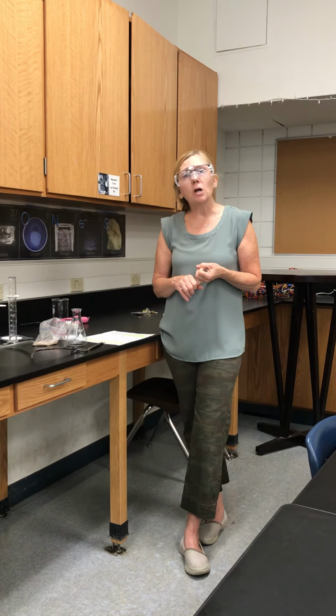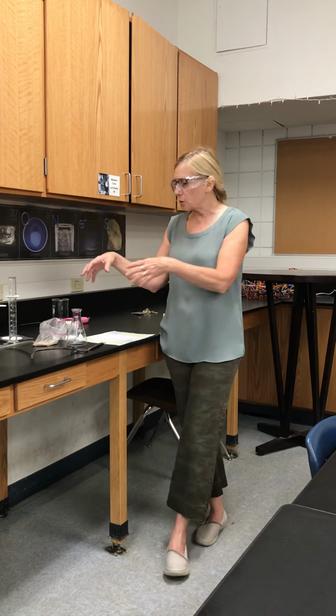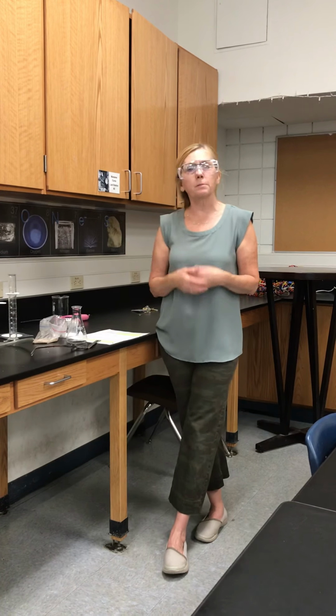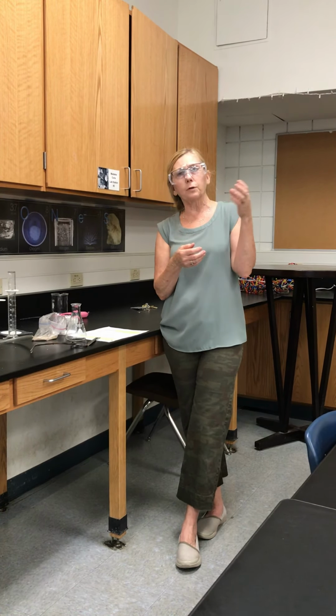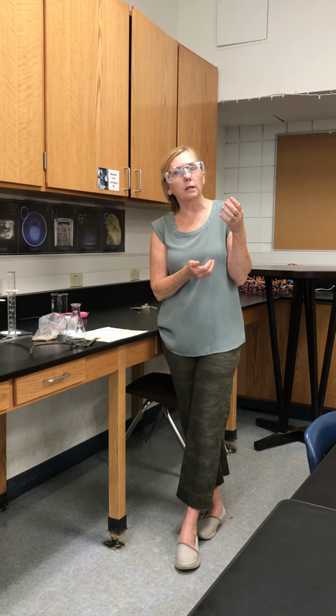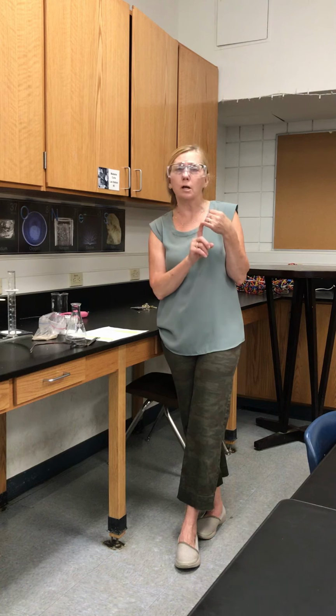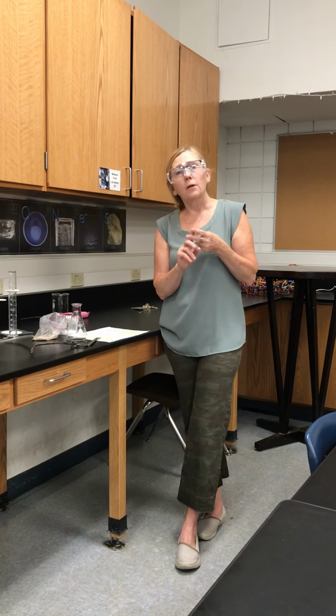Production of a solid, and in chemistry we call that a salt. So if you're mixing two chemicals and you have it over the Bunsen burner, and all of a sudden you notice there's some kind of material floating around in the liquid or settling to the bottom, that's a solid, and we call that a salt. So it's a production of gas, production of a solid. Those are two signs. The other two signs would be a change in temperature.